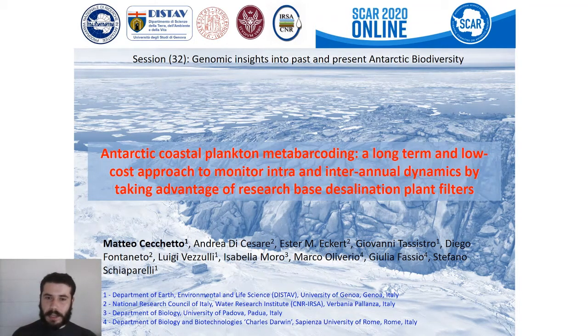For this presentation, I'm going to present a project we've been working on the last couple of years, and in specific about the application of high-throughput sequencing technologies to the filters of the desalination plant of the Italian research base Mario Zucchelli to disclose the intra and interannual variations of the nanoplankton communities in Terranova Bay in the Ross Sea.